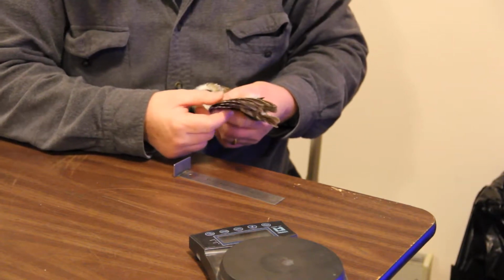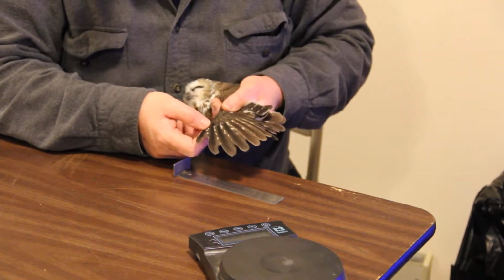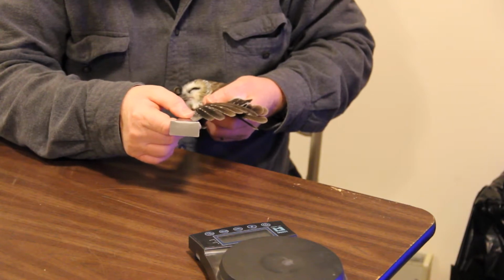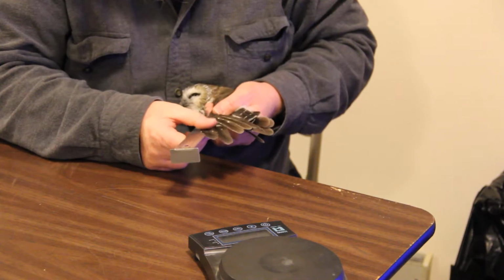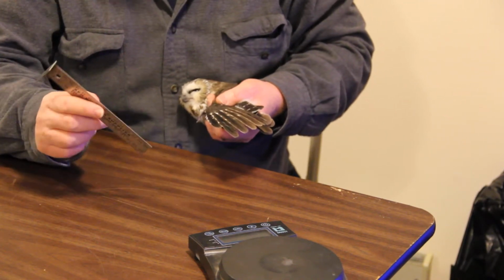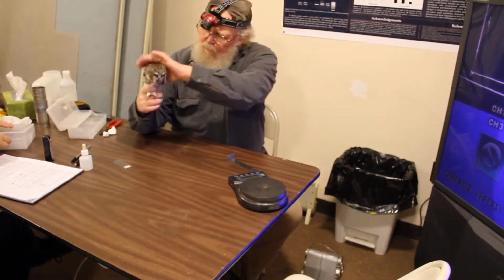And now what he's going to do is measure the 8th primary. And the primary on the outside feather, that farthest feather, is the 10th, so he's just going to count inwards. So 10 is the outside, then 9 and 8. So it's going to be the third feather from the outside. And he just slides that in till it hits the side of the wing. And then he just lays it flat and takes a measurement. 111. And that is how you band a saw-whet owl.